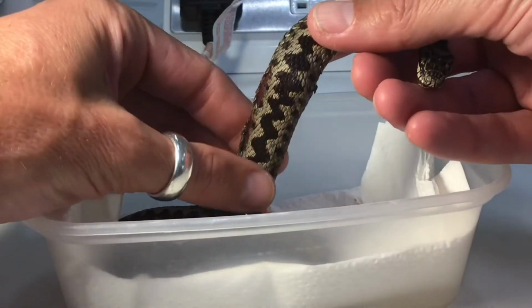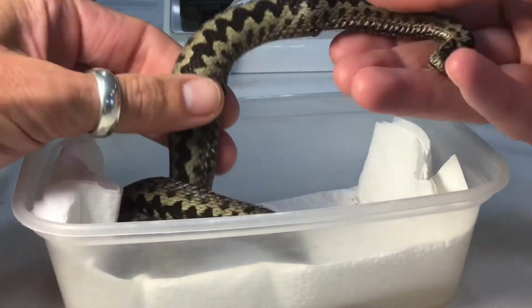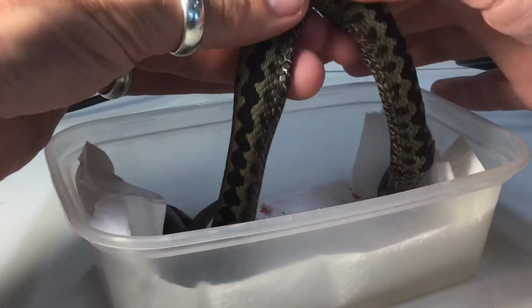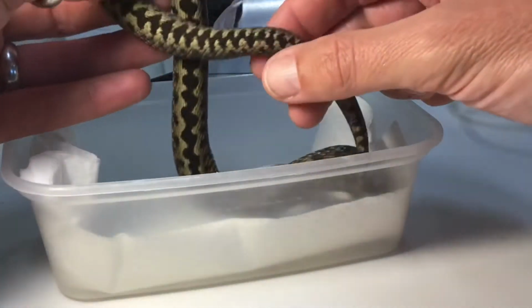And you can actually see the injury here. There's an injury there, which led to the cause of death, but otherwise, beautiful specimen, very, very supple, very soft, and in remarkable condition.